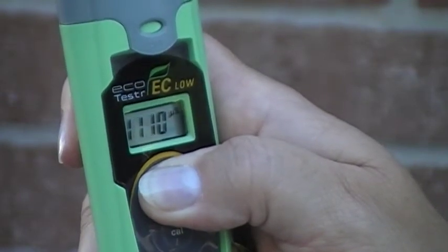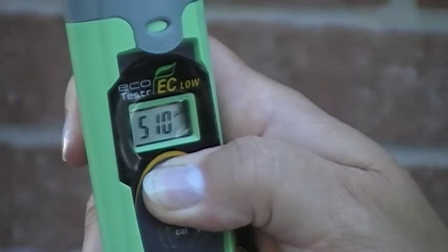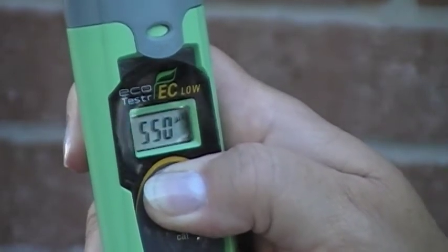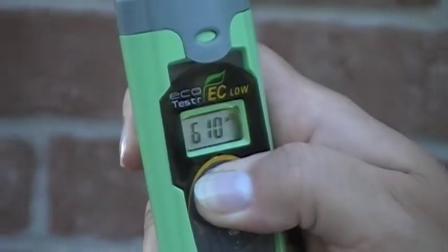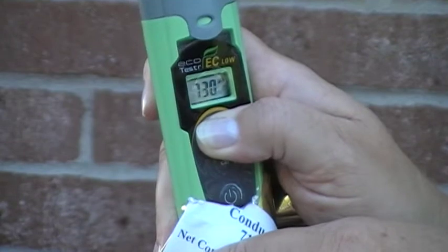You can calibrate your conductivity meter the night before a sampling event, and it will be good for the next day. It doesn't matter how many sampling sites you have — it will be good as long as they're all done on the same day.